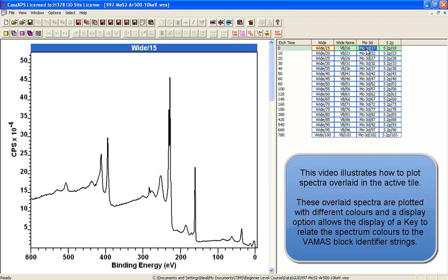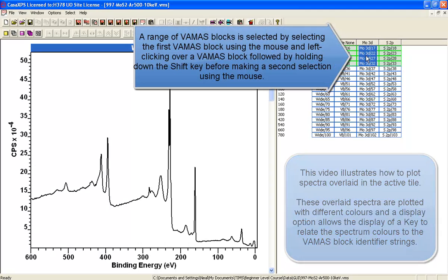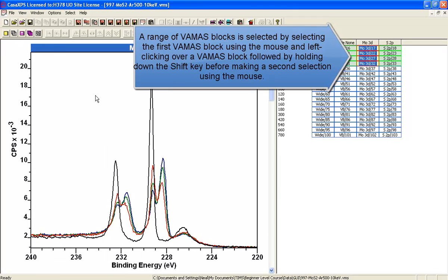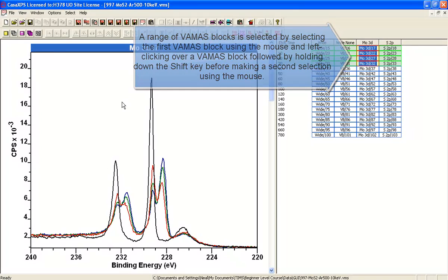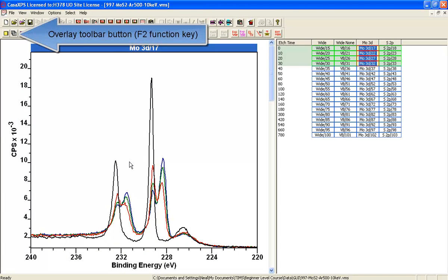We can select a range of VAMAS blocks in the right hand side and press the overlay F2 button to display the spectra in the left hand side in the active tile.